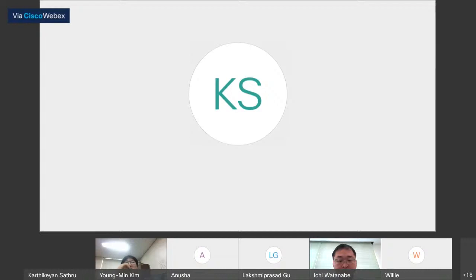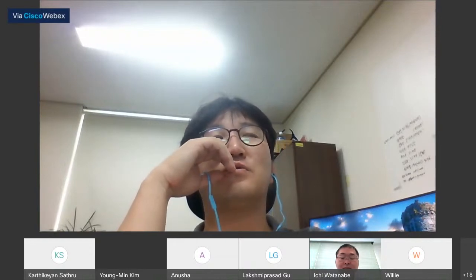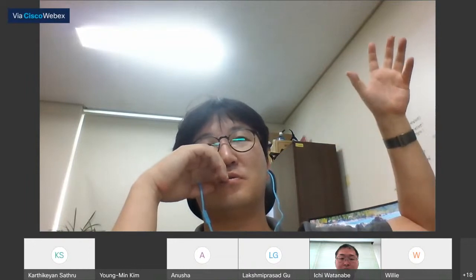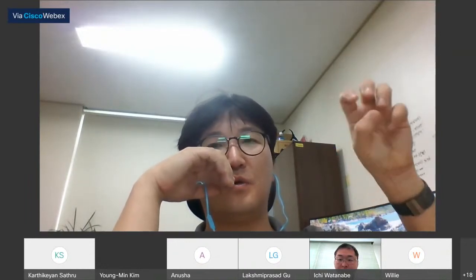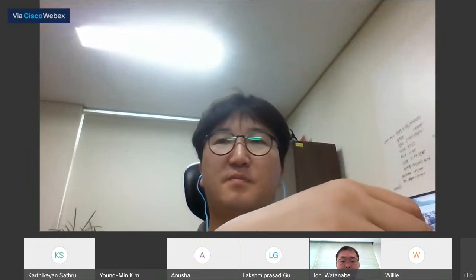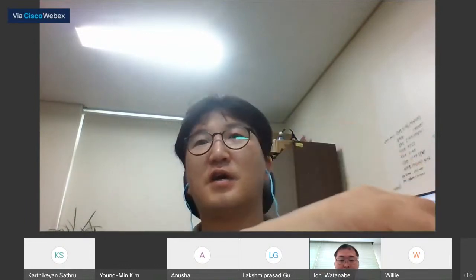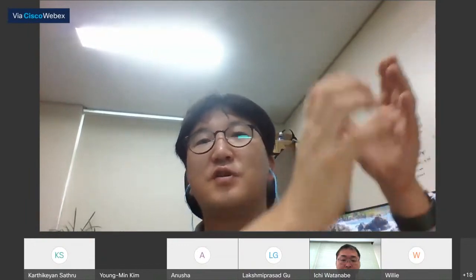Okay, I can answer now. Normally, before the development of tandem and pyrolyzer GC-MS, people did the reactions offline. Normally they use lab-size reactors, and they have to condense the product oil and use separate systems. They have to collect the oil and inject it into a separate GC-MS. But the problem is that the yield of gas, liquid and solid was not easy to determine, because it's very difficult to recover all of the gas products. Some heavy oils are condensed in the condenser, so we can recover those.